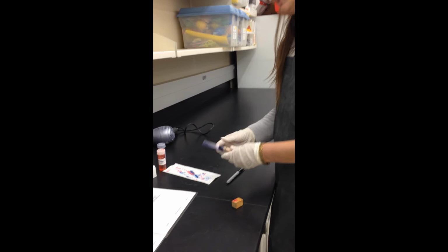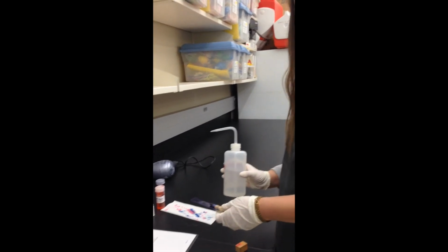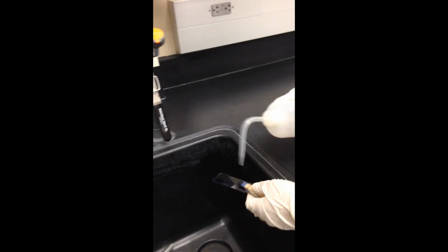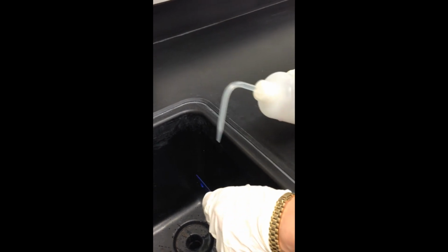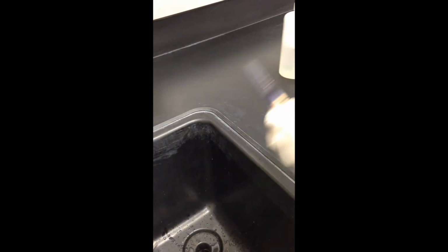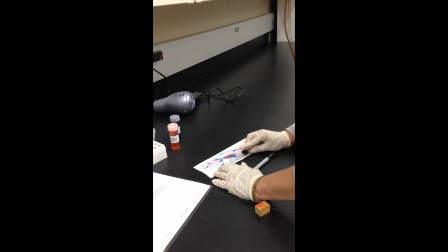Actually, if you read your directions, it'll tell you to thoroughly rinse the excess stain off of your slide. So we're going to do that at the sink. Don't be worried that you'll wash away your cells. They're on here, they're splatted, and the cells have absorbed the stain. So we're not washing everything away, we're just washing away the excess. Okay, so we'll blot that again.